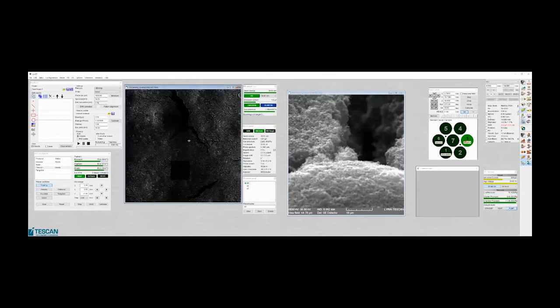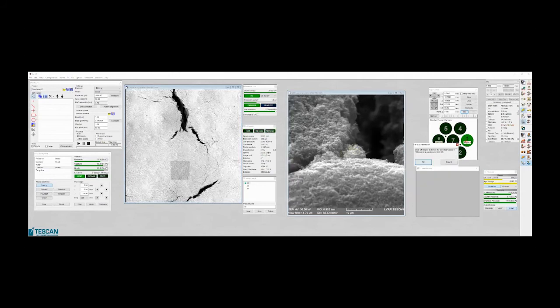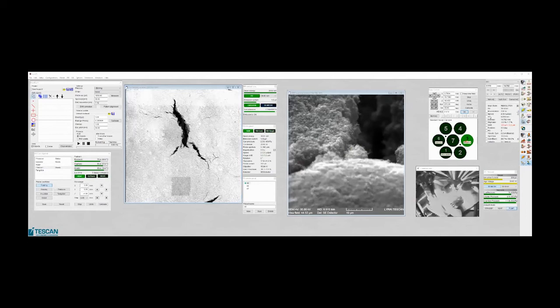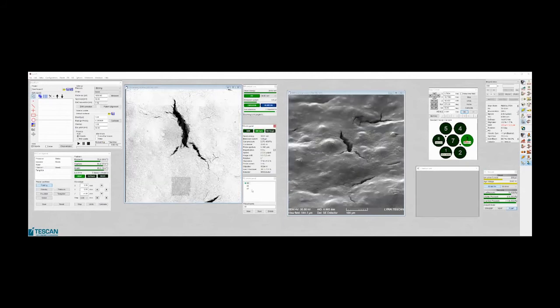Okay. We will try it. Okay, we have different contrast. So here we are. We have to align it more or less. Okay, so it's this one. Okay, feature. Okay, this was too huge. Cool. I will just measure the current to check that everything's fine. So we can go closer.